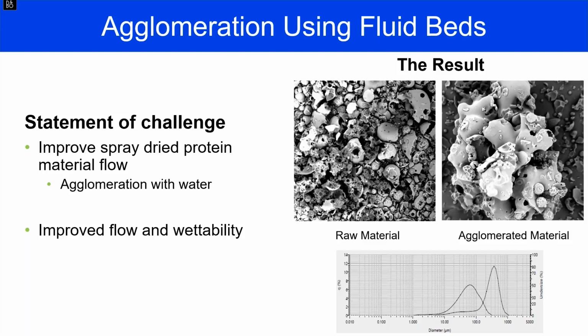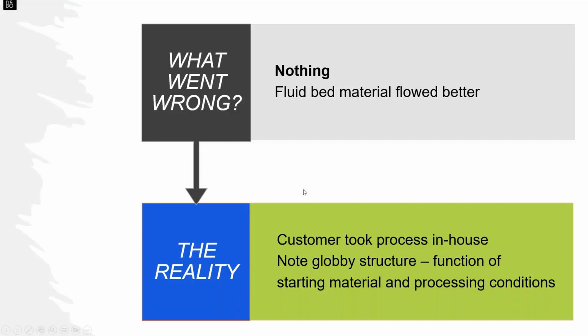it might not have made any difference what the starting material looked like. It was just remarkable to me what it looked like. But the ending structure here tells me something about how good I'm doing. In later experiments, we went back and lowered the water rate and changed the atomization to get a better looking product. But I thought it was very illustrative what's going on here.